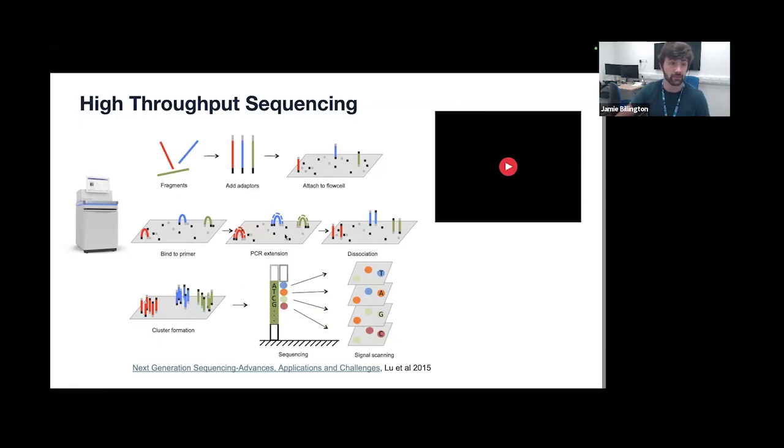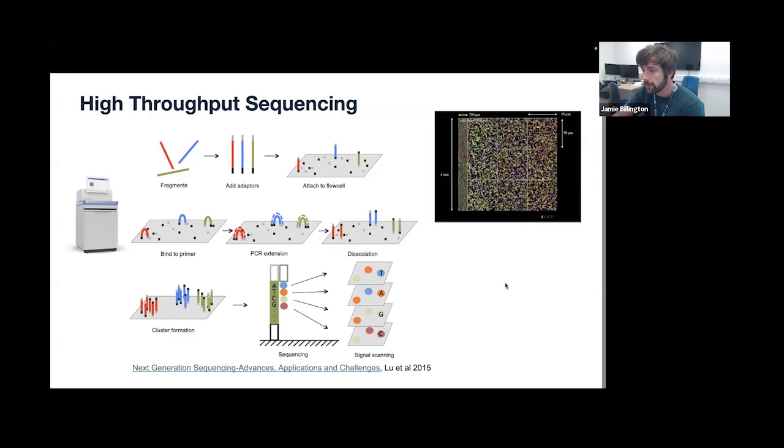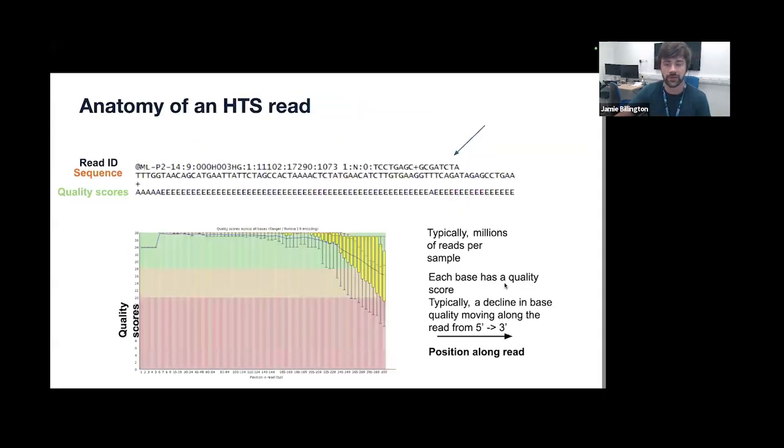One thing to note is that this reaction gets more inefficient the longer it goes on for. So we're often limited in how long a region of DNA we can sequence with this method. Typically, it's about 150 base pairs. And that's all right for our case, because we'll be looking at guide RNAs, which are about 20 to 30 base pairs. So, chemistry over, now we move on to the computational world.